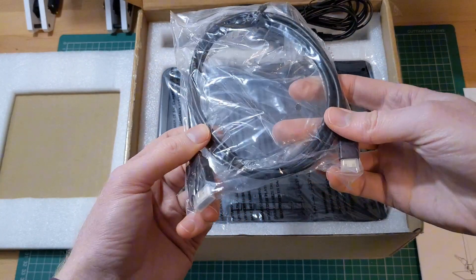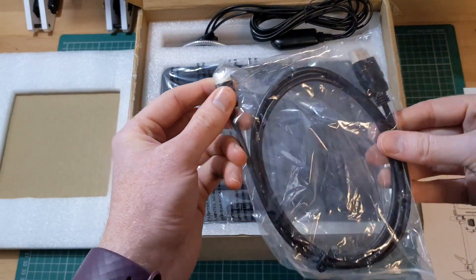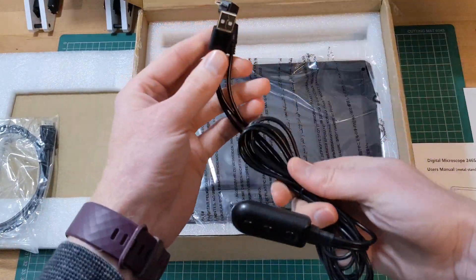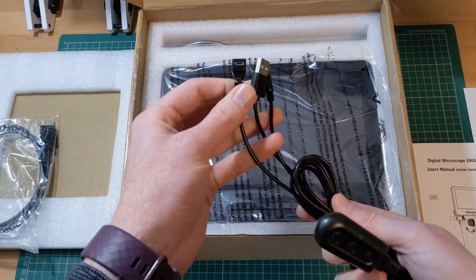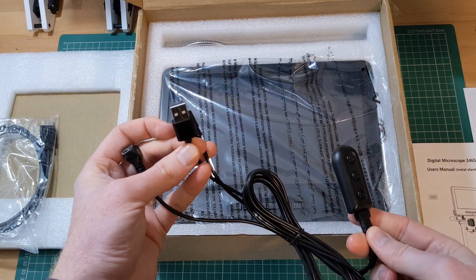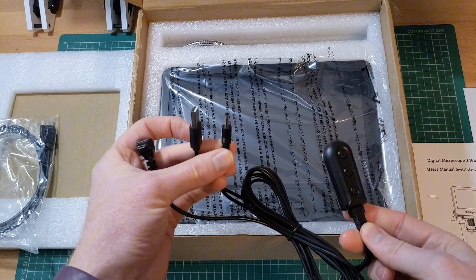You can see the various accessories and the microscope itself. There is an HDMI cable to attach to an external monitor. The power USB cable plugs into a USB-A port and then connects to the microscope and lights via an inline switch with dimmer capability.